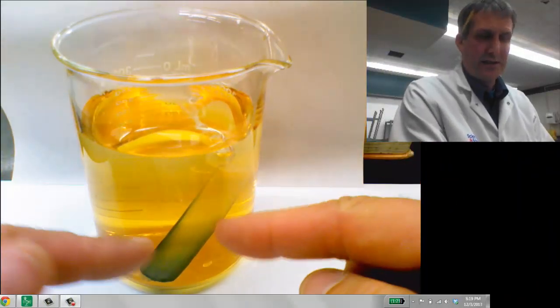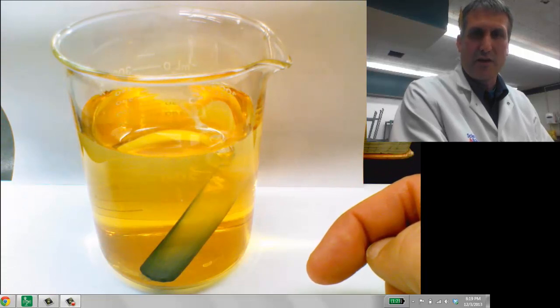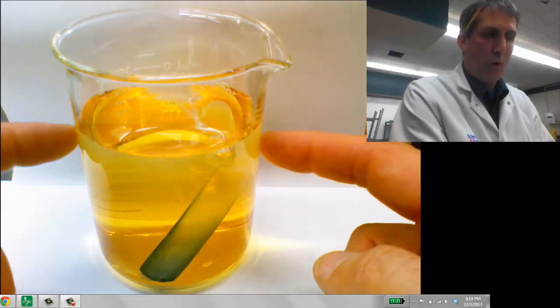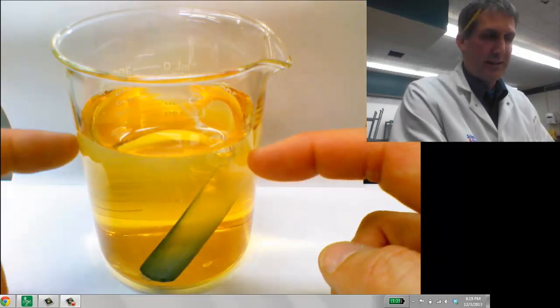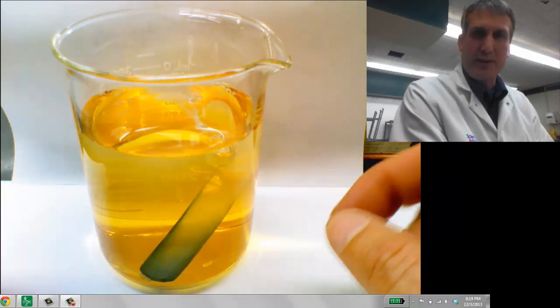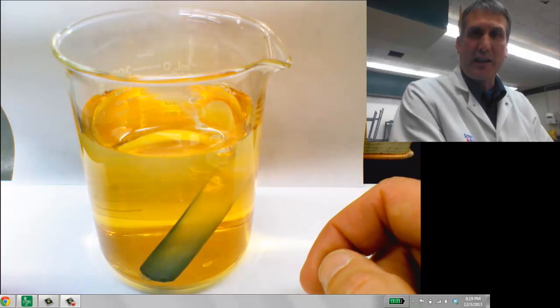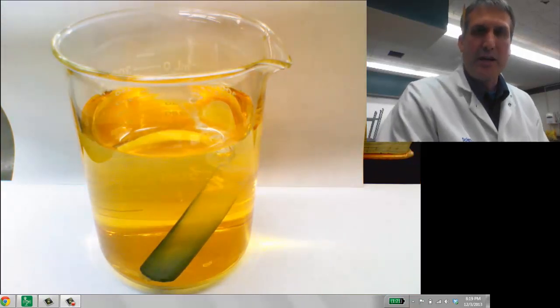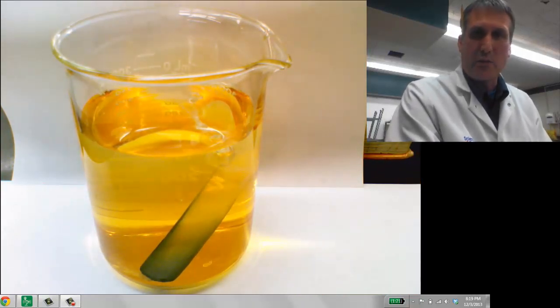So here's our complete setup. The 400 milliliter beaker. Your cell with glucose solution and starch inside. Water filling up and covering the cell with iodine in the water on the outside. Now you want to put this aside. Make sure you label it so you can find your beaker. Because we're going to let this sit. And then we're going to come back to it and see if we can tell which molecules diffused in what direction.